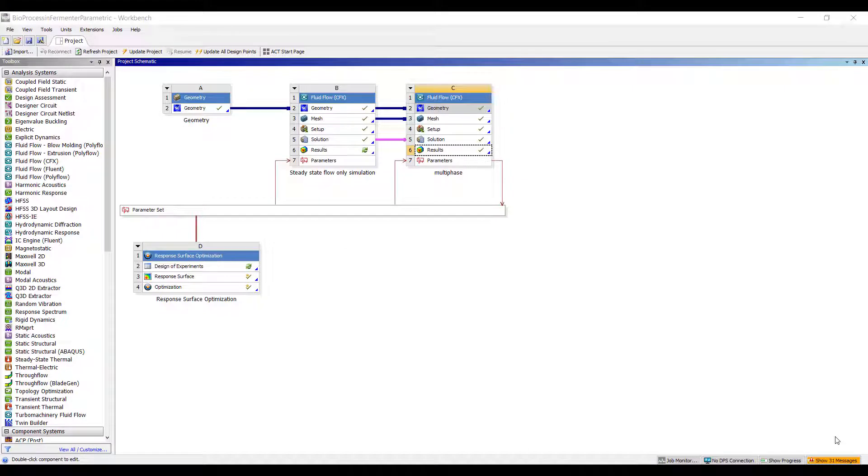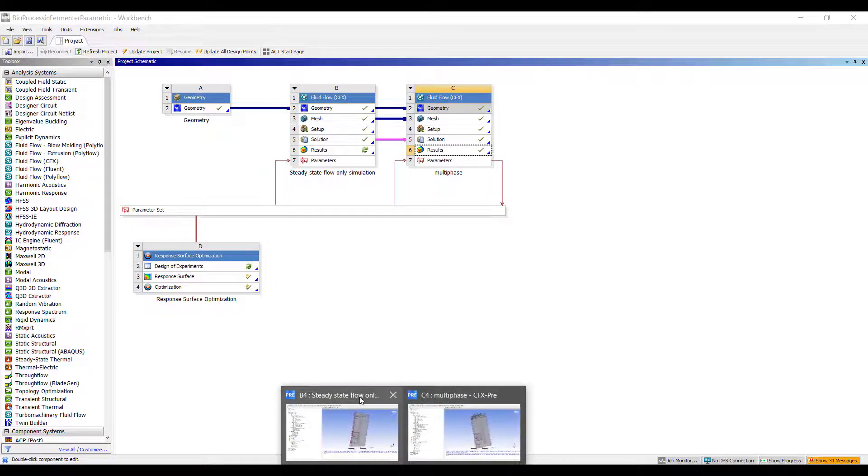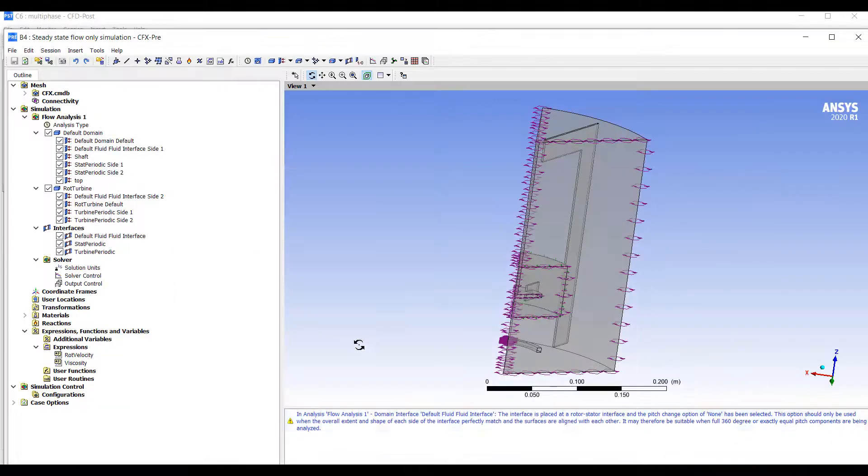Hi everyone, this is Ming Yao from Singularity Engineering. In this video we'll finish off our bioprocessing simulation of a fermenter by making a parametric analysis. This is a continuation of the other videos in the series. If you haven't seen those please do check it out. We're going to start with a completed simulation here.